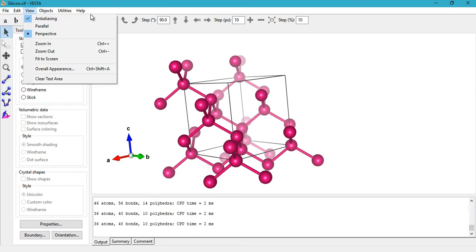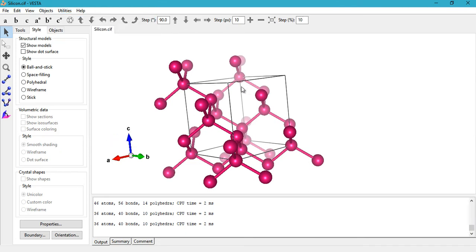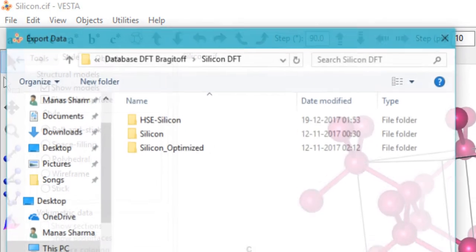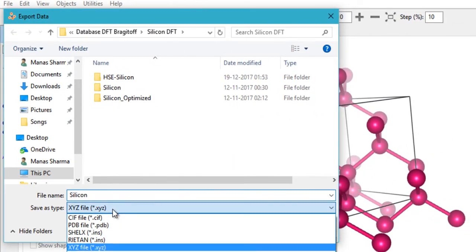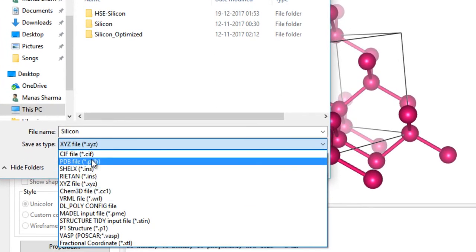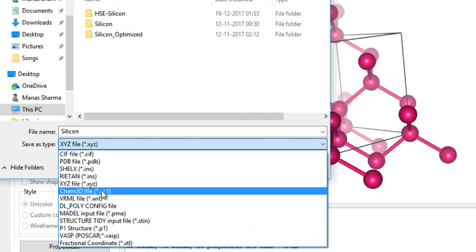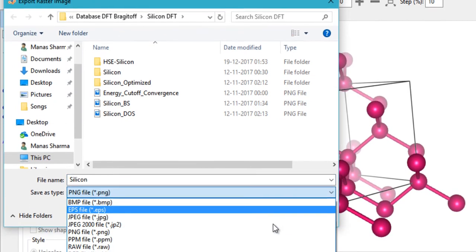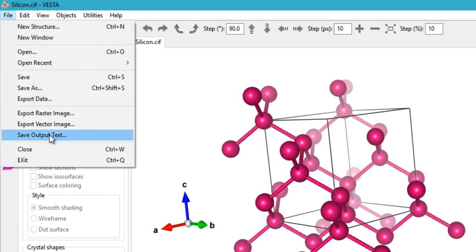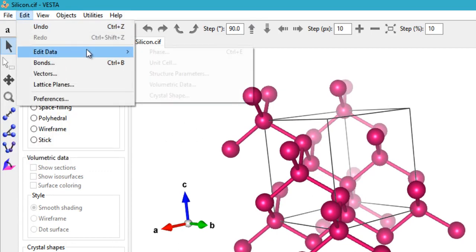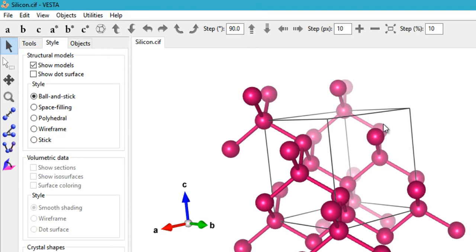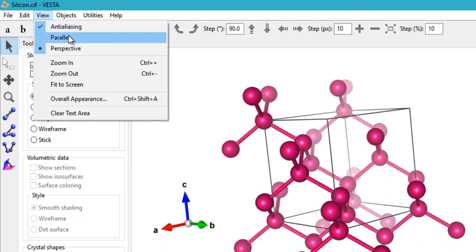Let me quickly cover the menu bar. Under File you have New Structure, New Window, Open, and Recent. You can export your structure as an XYZ file, PDB file, CIF file, or input files for software like VASP or CrystalMaker. You can also export the current view as an image in various formats. Under Edit you can edit your unit cell, phases, and structure parameters, or create a unit cell from scratch.